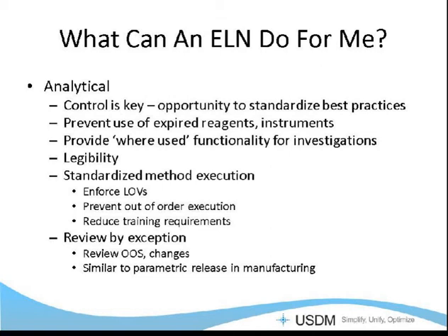Another key, and I'm guilty of this myself, I should have been a doctor the way that I write. A lot of times you can't read what someone writes, and also they don't write in the standard format that you might want. This helps with legibility because it's all typed in and it's easier to read. As I said before, you generally have standardized method execution in an analytical laboratory. So this helps you enforce the list of values, prevents people from going out of order if there's a certain order that's required for execution. And since it walks people through the process, there are fewer training requirements because it takes them step by step through without them having to learn or memorize it.